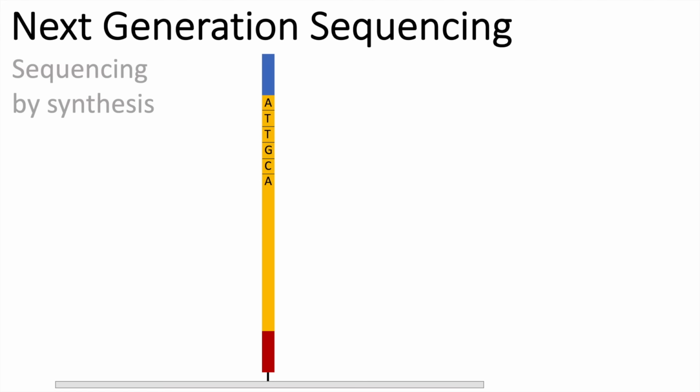For sequencing, we just look at one copy now. As mentioned in the beginning, a primer can bind to the oligonucleotides. So this is a sequencing binding site here. Sequencing is now done with specific nucleotides. These nucleotides in this case are fluorescently labeled. Only one of them will fit. In this case, the T.